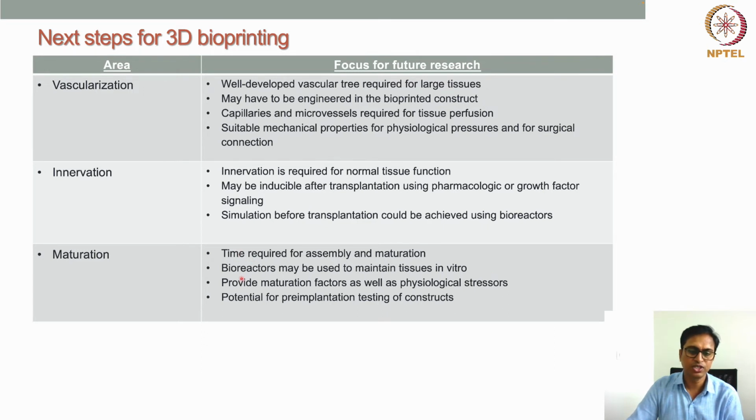Bioreactors are used for different purposes, like providing a dynamic culture condition to simulate the physiological loading, unloading, stretching, and also other signaling. All these things can be given in bioreactors. Bioreactors are also very important for maintaining the tissues in vitro and for further maturation.